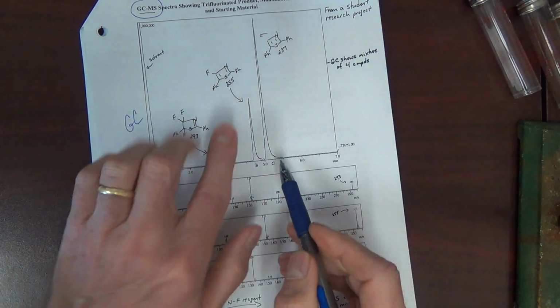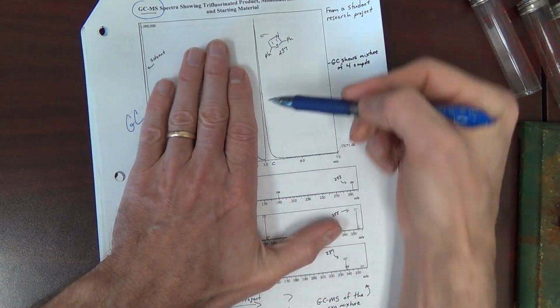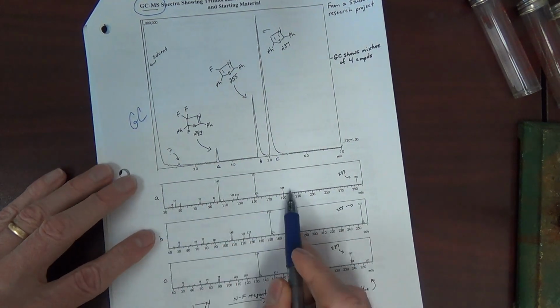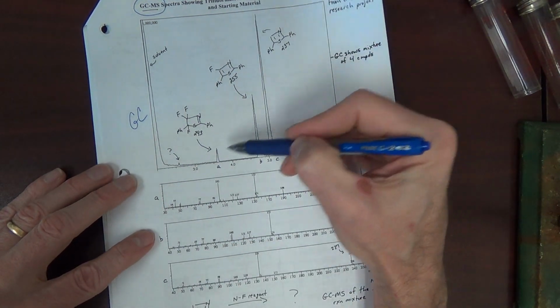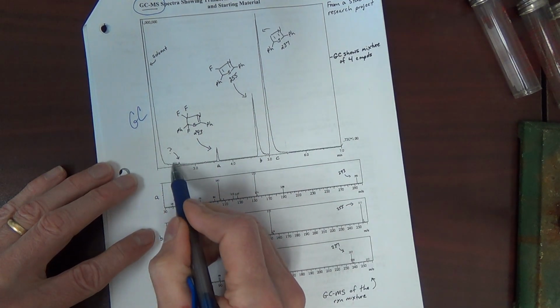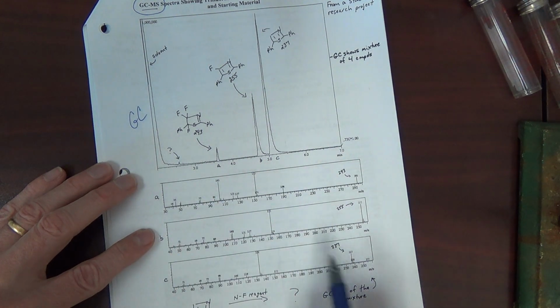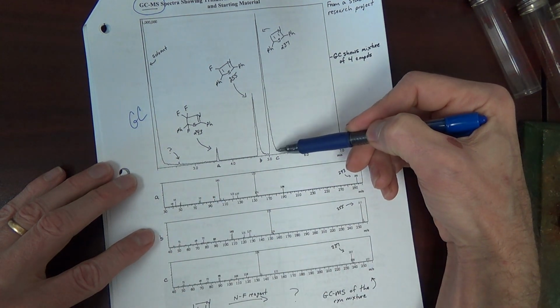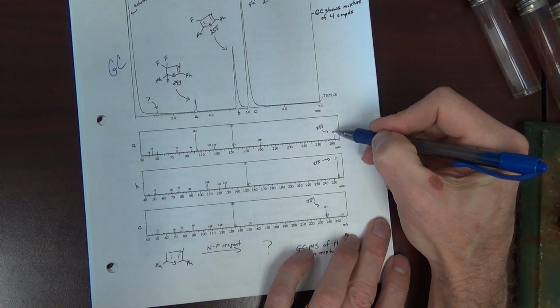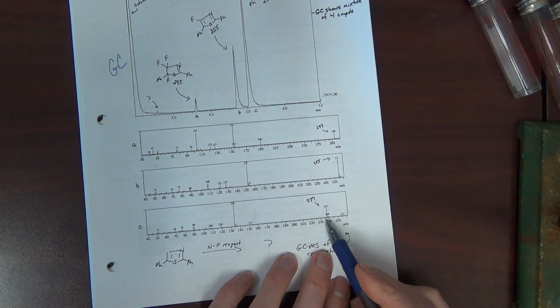Now, when this comes off the GC column, it goes to the mass spec as a single component. These are labeled A, B, C, and these are the mass specs of each of these peaks. For some reason, I'm not sure why we did not get a mass spec of this one, which would have been D. This is the mass spec of here, here, here. Molecular ions here of 293, 255, and 237.